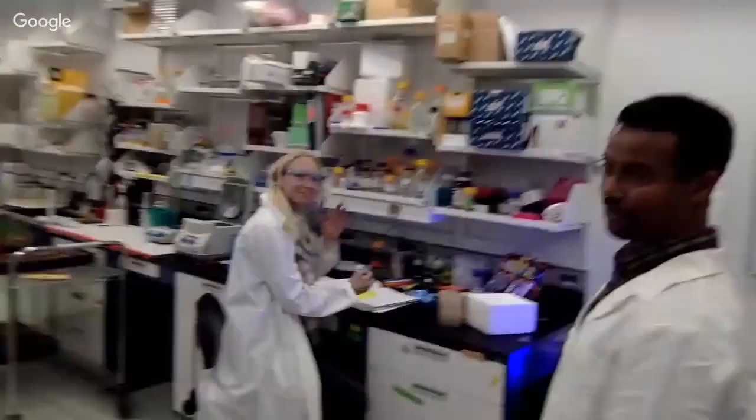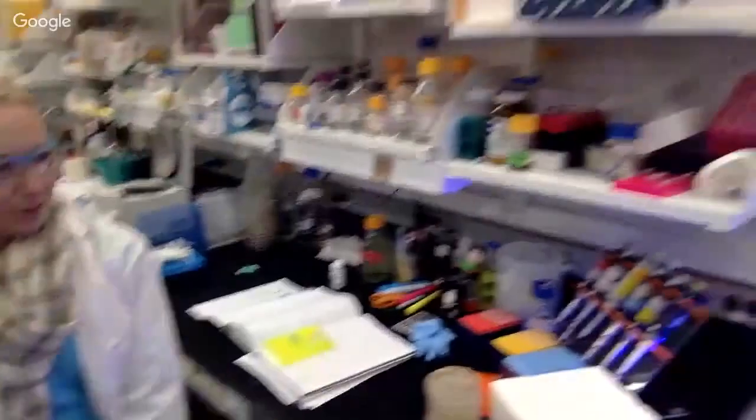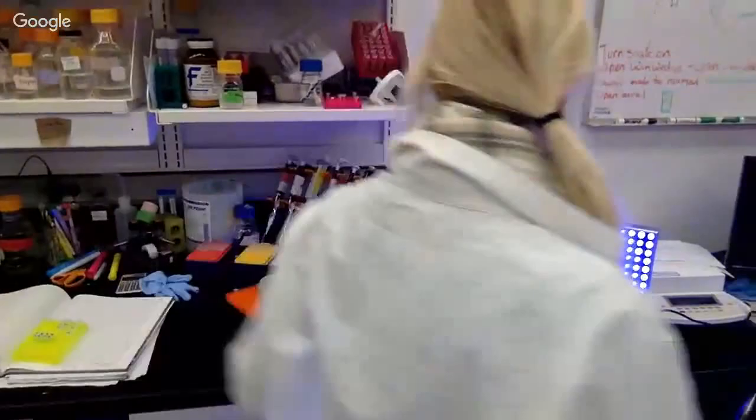My name is Inge and I'm a postdoc here in Jander's Lab. I just started a few months ago and I'm working on maize and defense against different herbivores. There are different projects. One is working on aphids, and here you can see one experiment—it's a blue light experiment. I have different vision lines. These are corn, Nastasja lines maybe I can show.